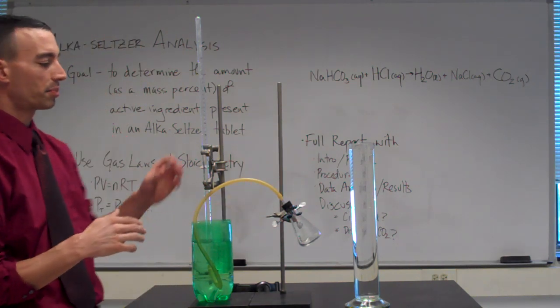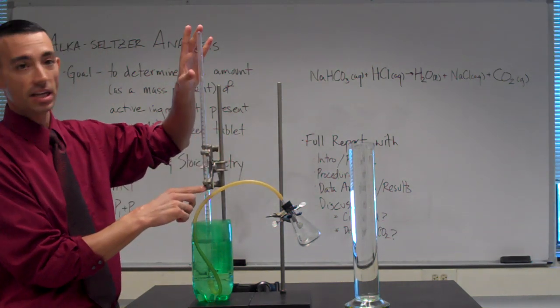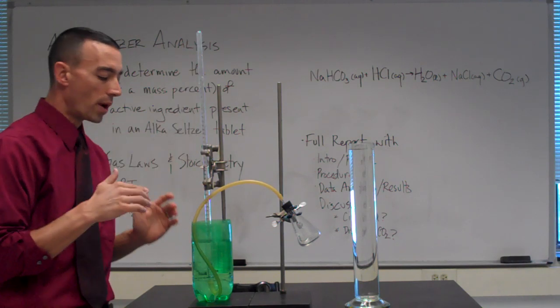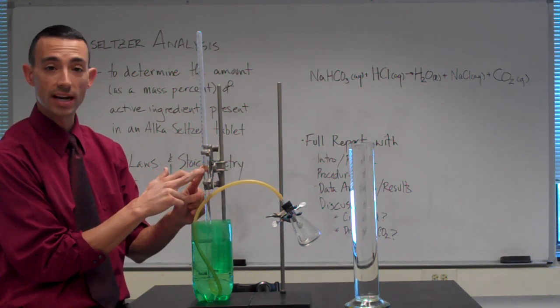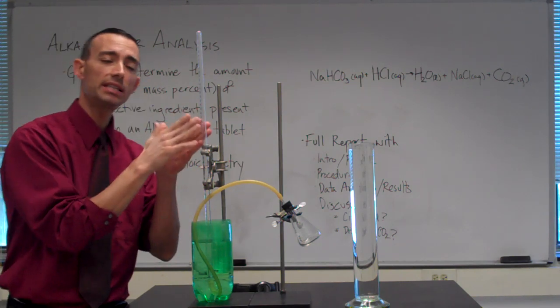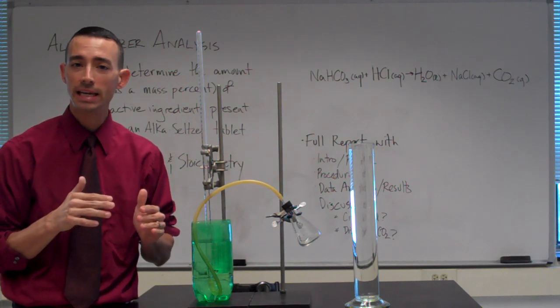Once your reaction is completed, and you can't see it probably on the video, you'll have collected a sample of gas inside this tube. We need to know how much gas. So you'd think maybe it's as obvious as reading the level of the gas right now. But unfortunately, the gas pressure inside this tube and outside of it right now are not equal.